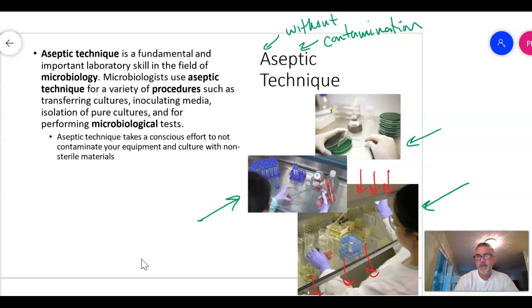And what that does is keep any exhaled gases from the technician here from entering the hood, or anything from people walking by entering the hood. We have bacteria floating and viruses floating. People sneeze, people cough, but it keeps all of that flowing out of the hood and doesn't contaminate. Again, you can see that she's pipetting from the side, so she doesn't contaminate her solution.